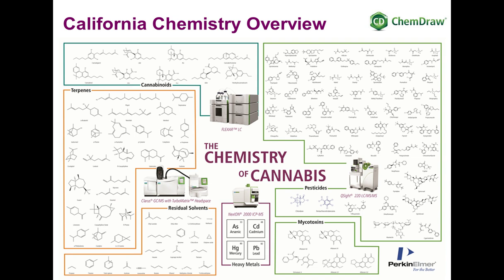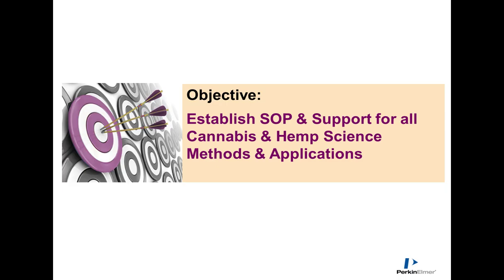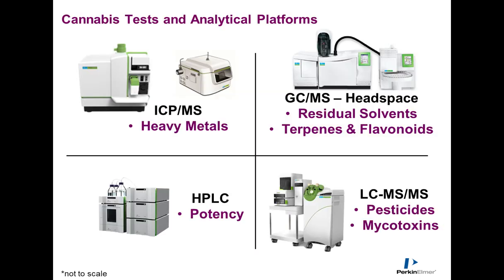What I'd like to do today is walk you through each of these methods and assays to speak a little bit more about the chemistry and some of the challenges that can present themselves. The overall objective is to be able to support you with an SOP, that's standard operating procedure, and the resources from PerkinElmer to allow the lab to be successful.